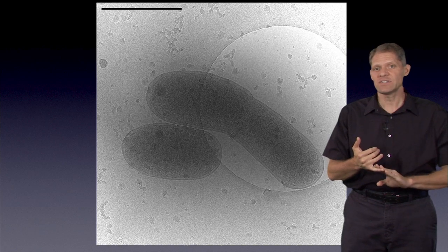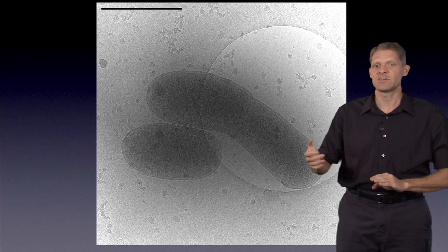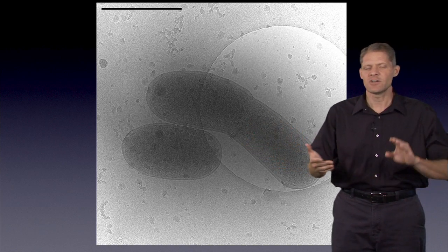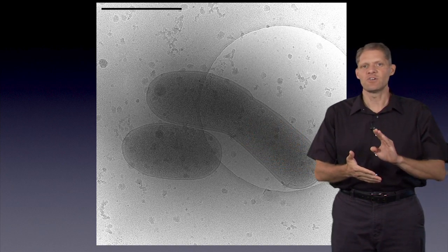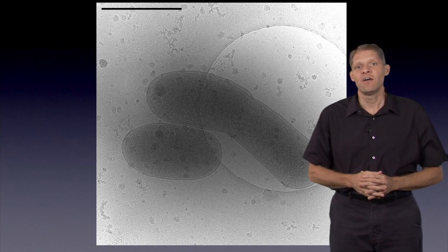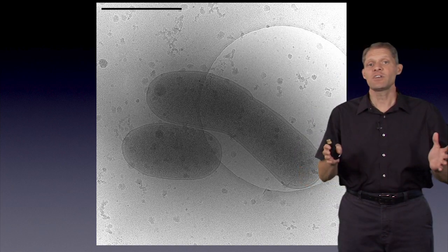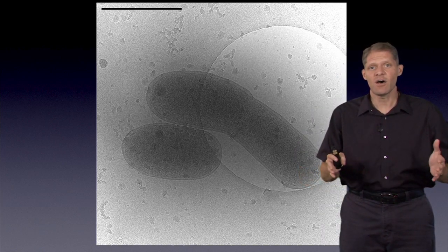There are no chemical fixatives altering the structure. There was no dehydration because they're still surrounded by the water. There's no plastic embedding. There's no sectioning or staining. It is a near native state that we can inspect now with an electron microscope. Now, this can be done with any thin object.